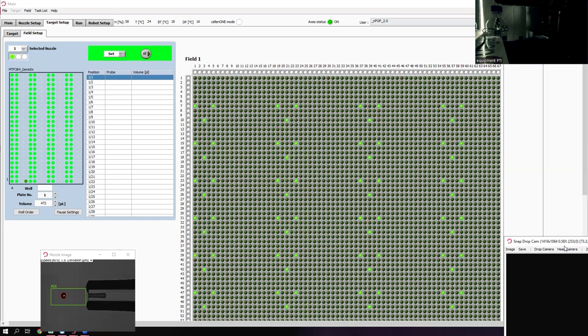which, if we were to ever get 200 labels, may be a little bit far off, but yeah, that's the way this is currently set up. And that divided by three is the number of samples. Each drop is going to get 9,000 picoliters, so 9 nanoliters of the DMSO.